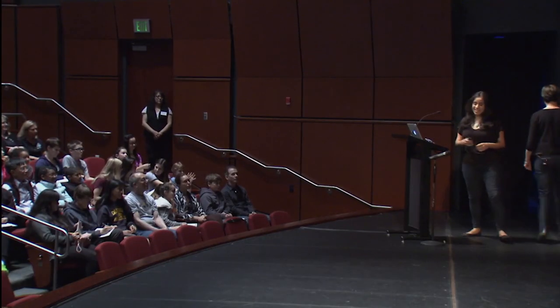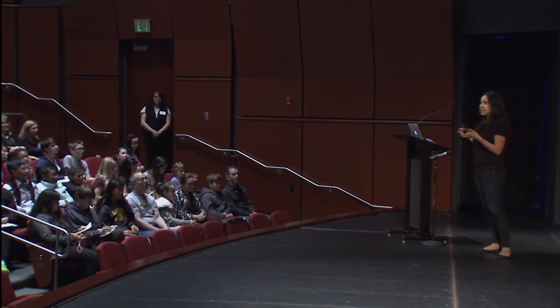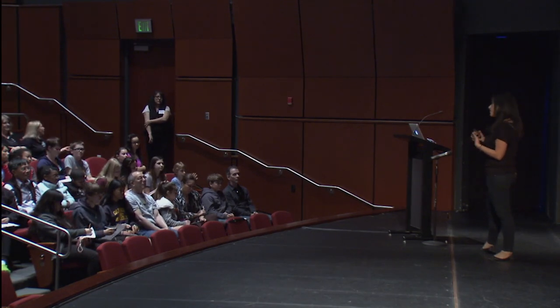Thank you, Sarah. So you heard from Sarah and from Heather before how we grow cells and we grow them directly on electrodes because what we're interested in is their electrophysiology. I'm going to change gears a little bit and I'm going to add another dimension, literally, to those devices. And I'm going to do that using a technology called bioprinting.